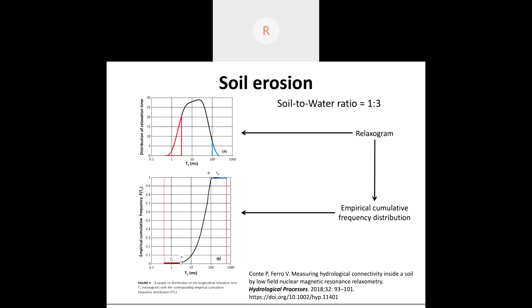Here we make an assumption: we assume that the maximum of TA is 1% and TB is 95%. That means that we can change our numbers by changing our assumption. So this is the limit of this approach.